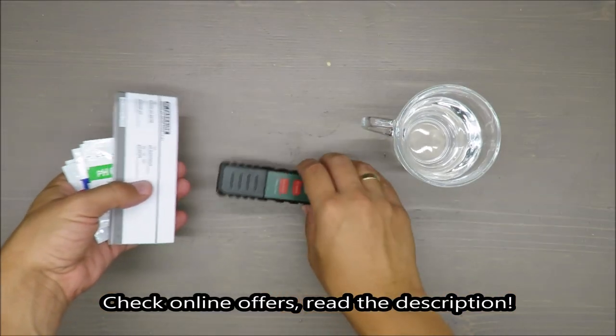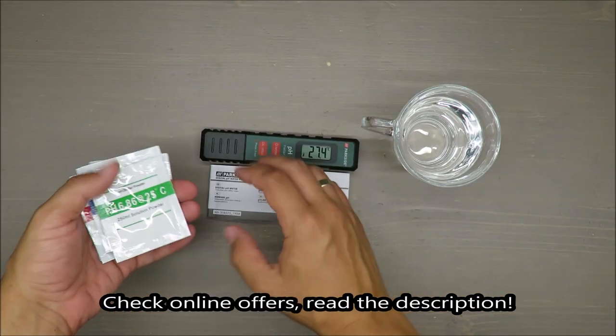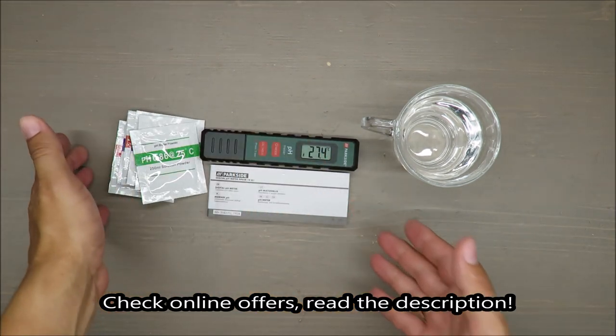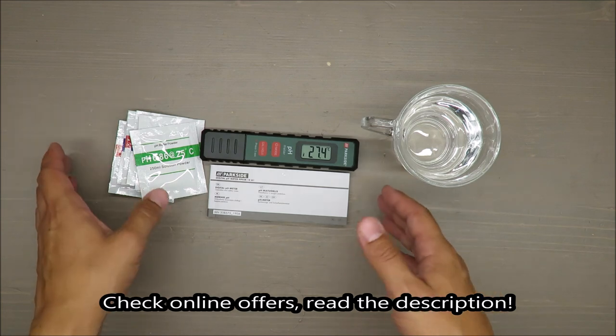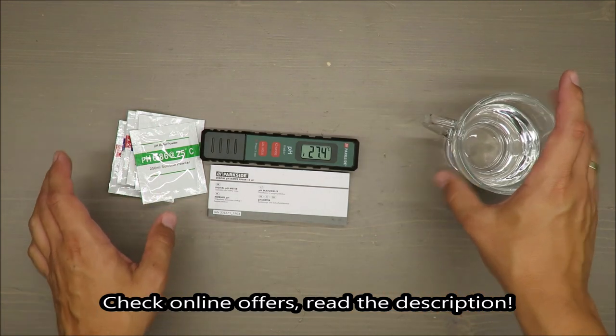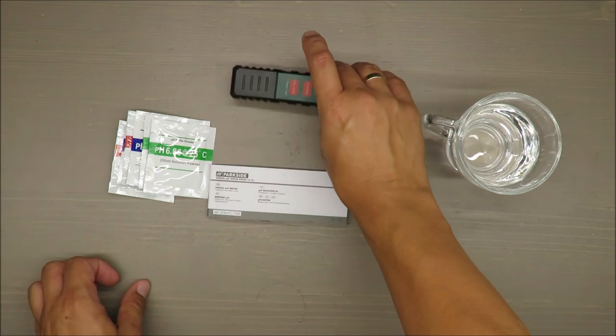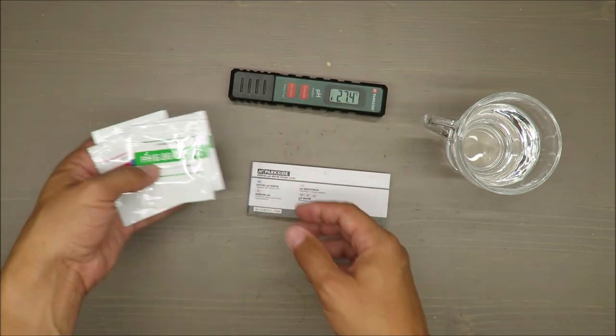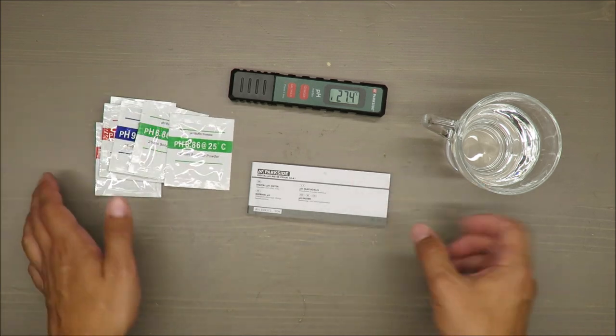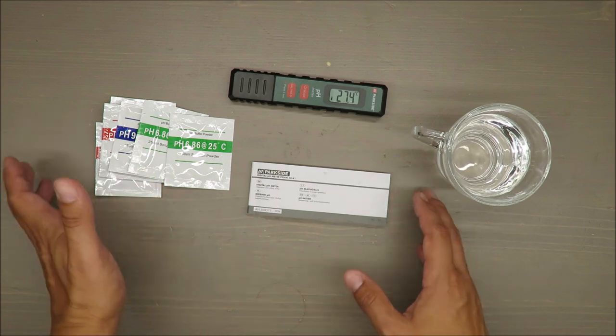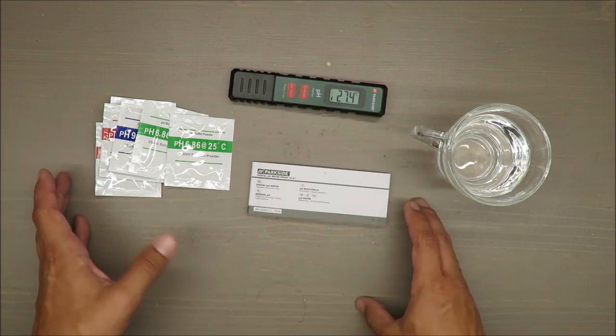Hello everybody, this is Out of the Box Unboxing and in today's episode I'm going to act like a chemist because I'm going to make a digital pH meter review. For that what we need is a pH meter, manual, some buffer powder, and a glass of water.